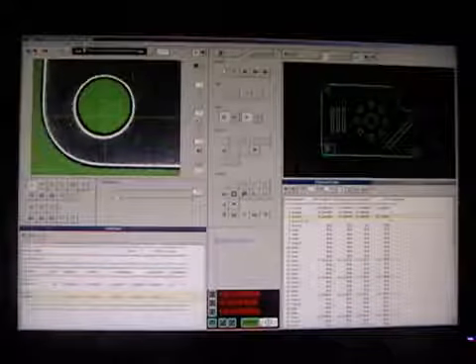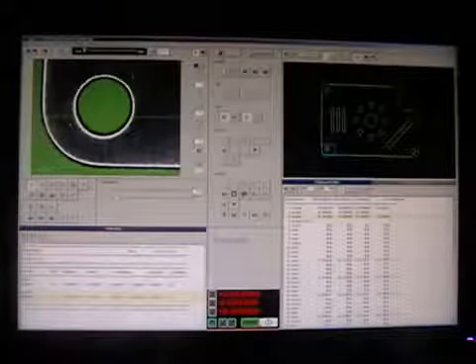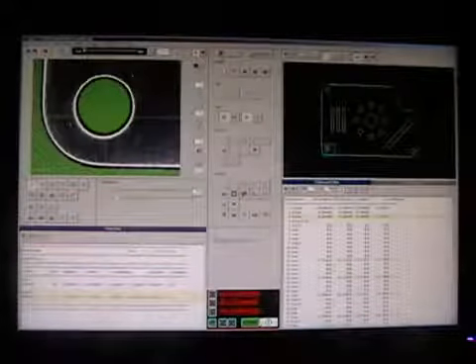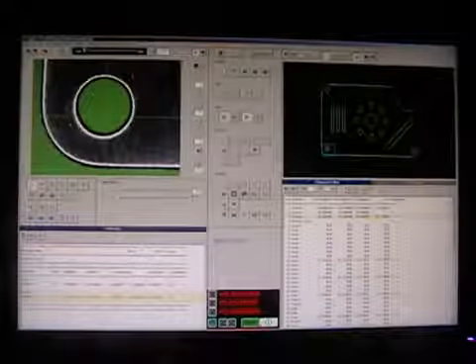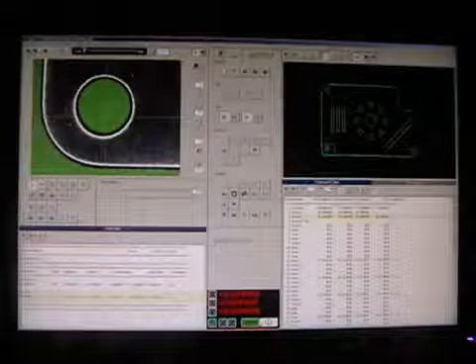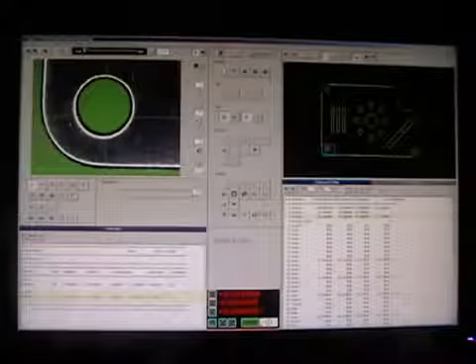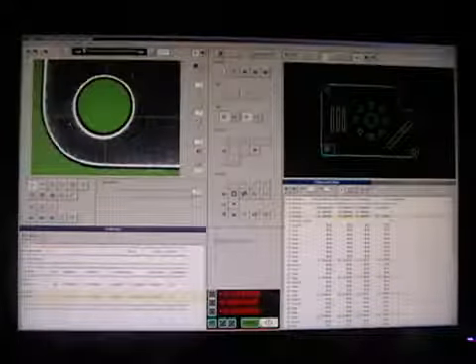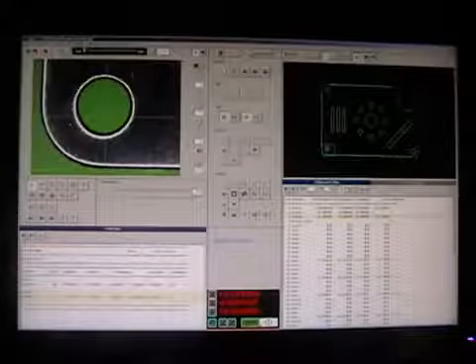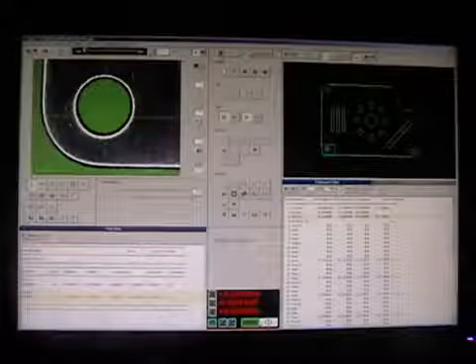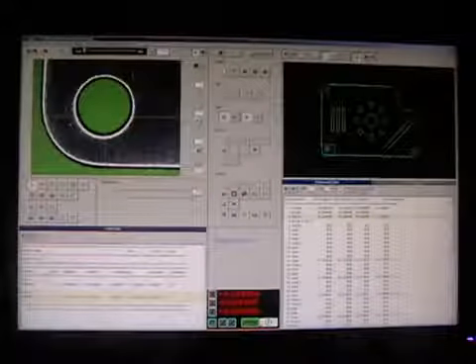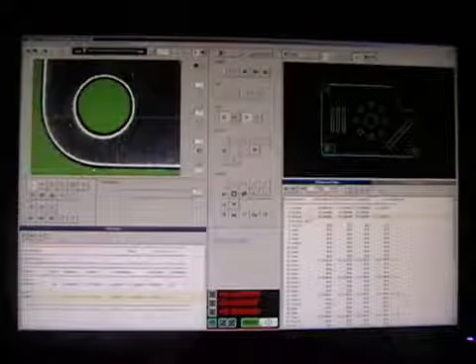These lighting controls are another way of adjusting lighting as compared to what we already saw with the knobs on the front of the system. Below the video image we have a toolbox that is used for selecting how we are going to acquire the data.